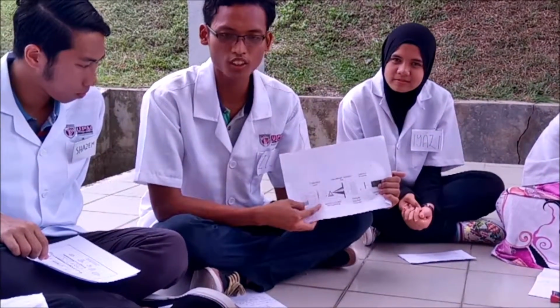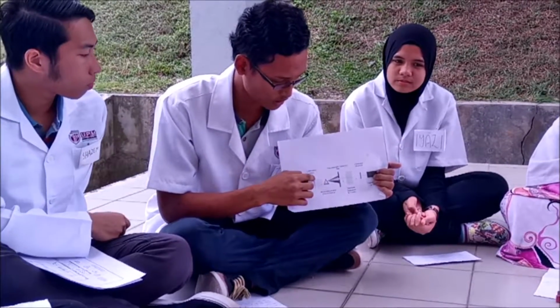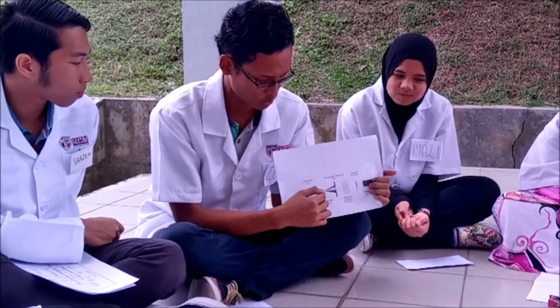Okay, so the next one is the lens, the collimator lens. Its function is only to focus the light from the light source to a single point into the monochromator. On the other hand, the monochromator will disperse the light. So this single light will go to the monochromator, and then it will disperse into 7 colors, for example.